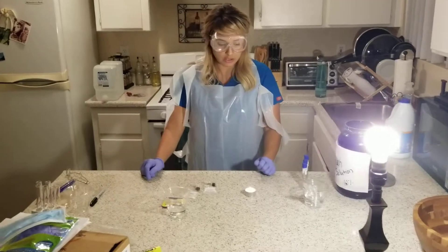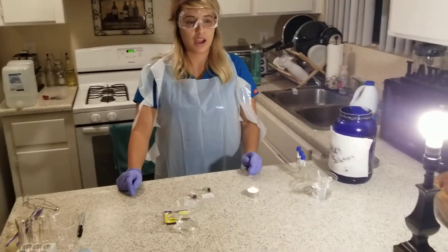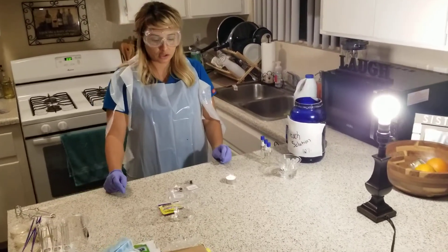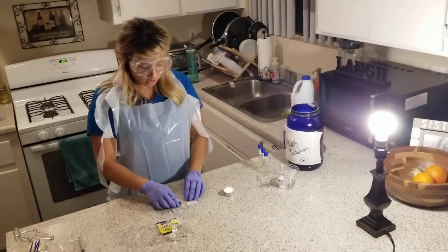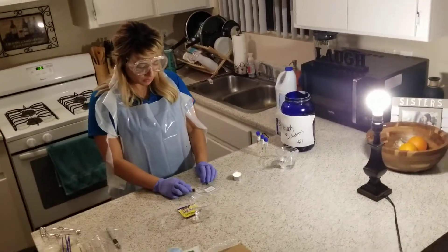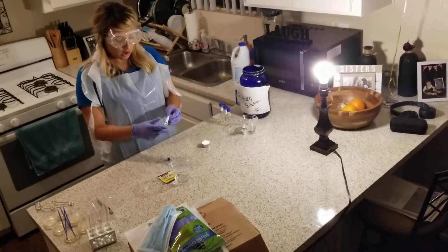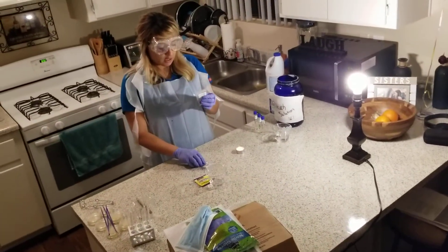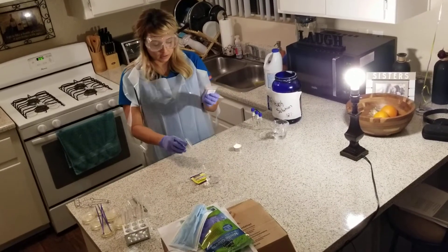What we're supposed to do in this lab is show you how we use antiseptic techniques to have a sterile culture. The cultures that I will be putting into a nutrient broth are going to be the S. epidermidis, which is the Staphylococcus epidermidis.